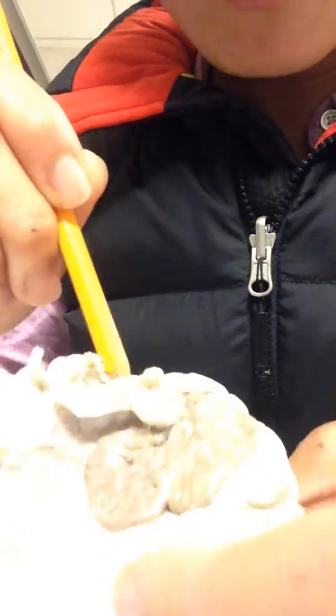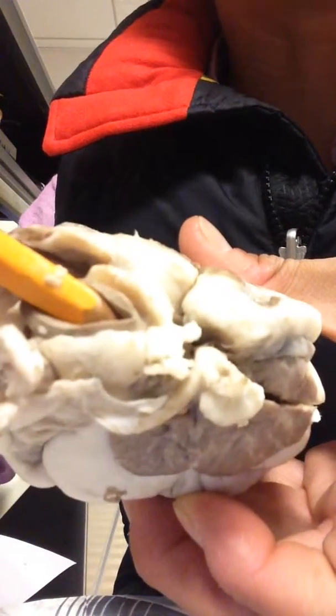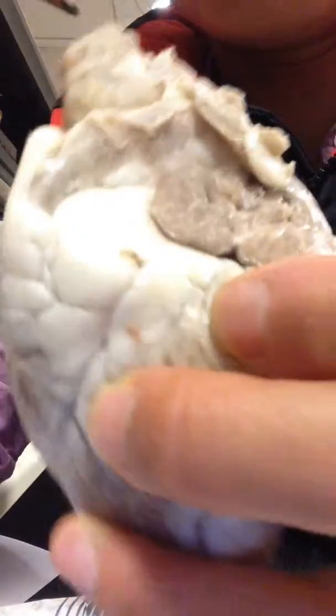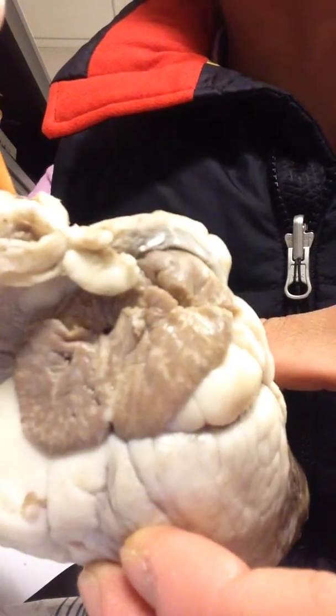Okay, so let's see. This is the back. Oh, sorry. This is the back. There are three here. So there are three. Where's the third one? It's right here. Okay, so this right one here is the brachiocephalic trunk, and then this one here is the left common carotid artery, and the middle one is... And then there's a very left one, and that one is the left subclavian artery.